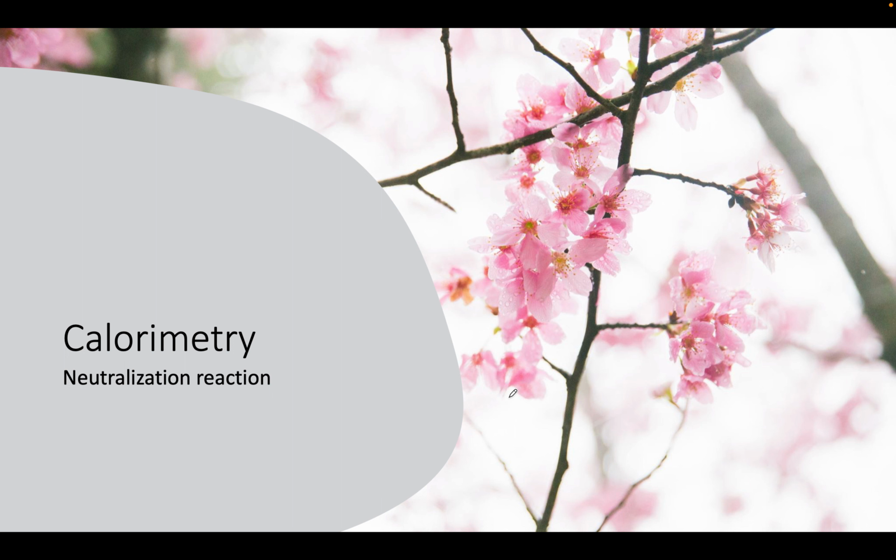In the thermochem unit, you learn about calorimetry, and we're going to use the formula ΔH equals negative mcΔT, which you use for any calorimetry experiment. We'll get into this a little more, but what we should know already is the left-hand side is about the reaction and the right-hand side is about the water. And if you do not see water directly, then we have to think, what would make water?